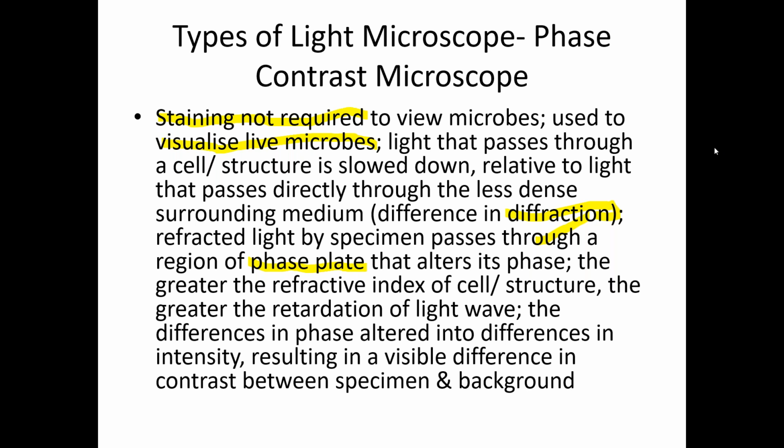Contrast. Already we have learned this topic. What do we do in order to increase the contrast? What is the technique we perform in order to increase the contrast? Difference between specimen and the background is contrast. Yes, Charlie, very good. Now tell me, what is the technique? Very good. Staining.